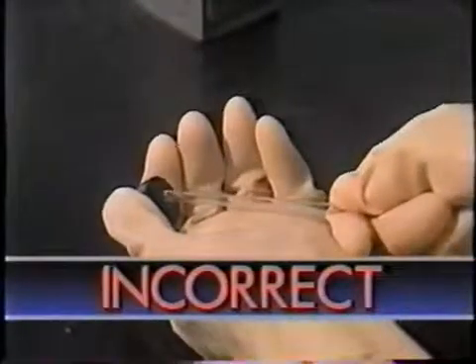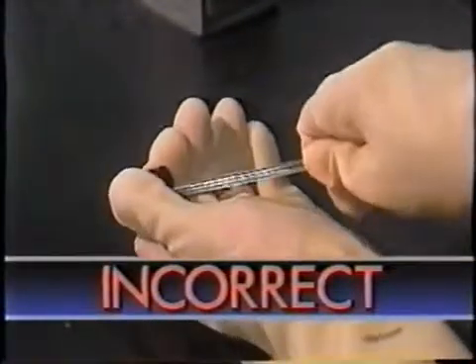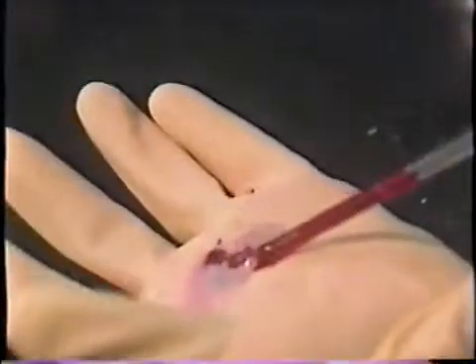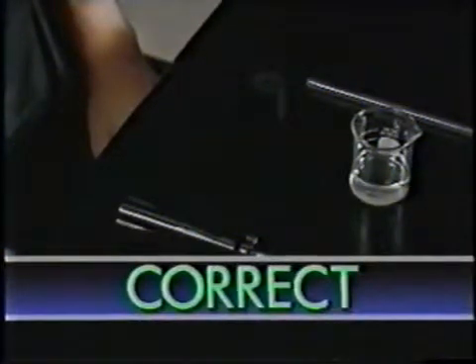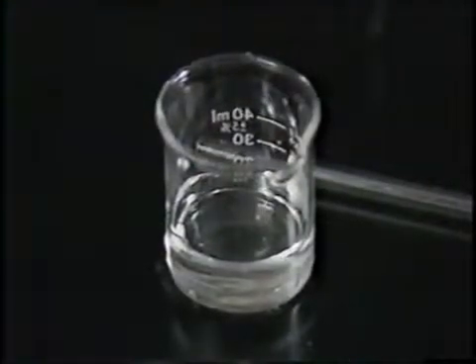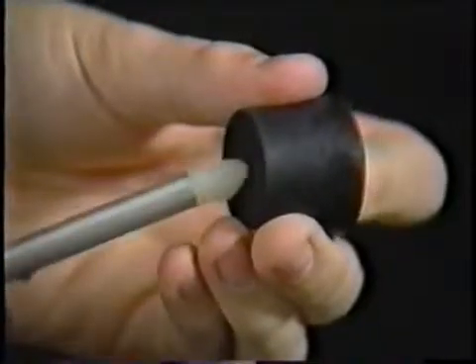The most common lab injuries are cuts from broken glass, especially glass tubing. A typical accident comes from using too much force to push a tube through the hole in a stopper. One way to avoid this kind of accident is to use an inserter. First, dip the Teflon tip in a glass lubricant such as glycerin, then push it through the stopper.